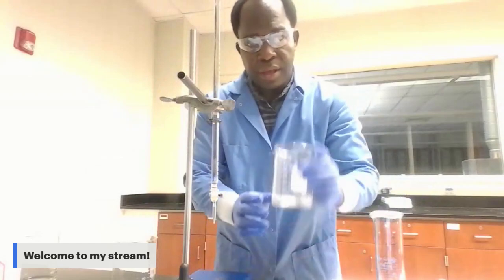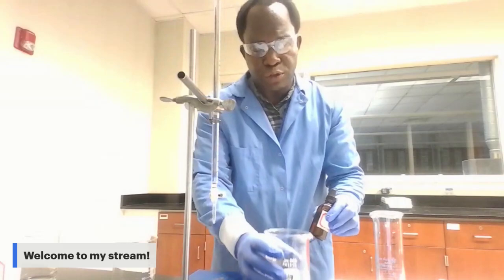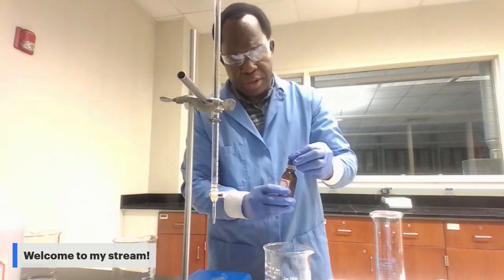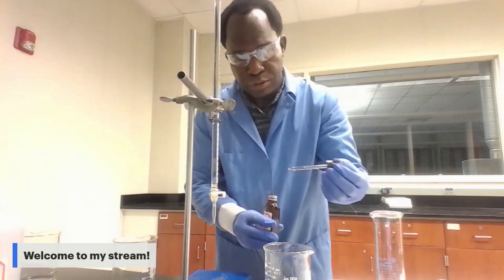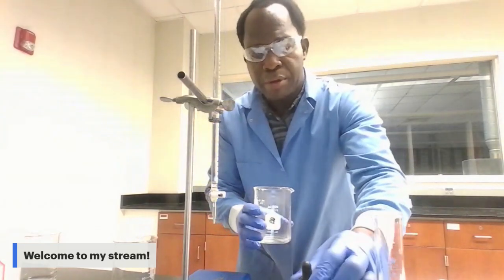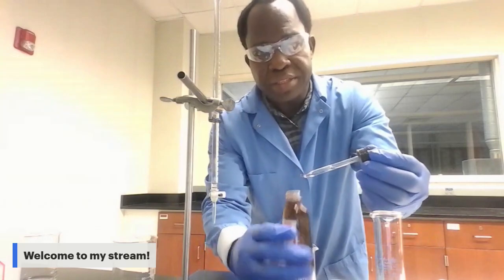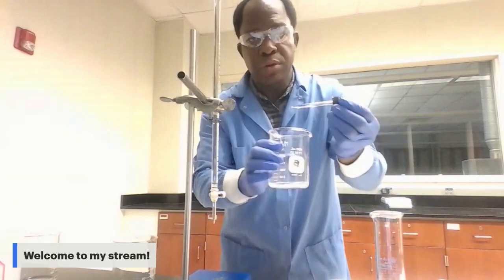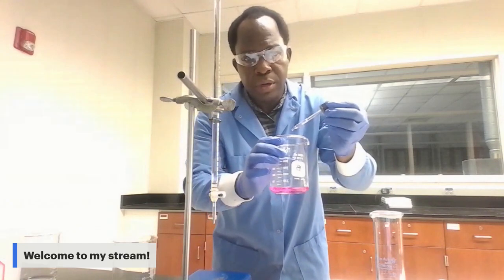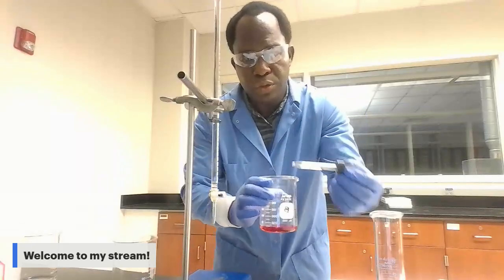Now, after you fill the beaker with 20 milliliters of Ca(OH)2, you have to add the color indicator. You need 5 drops in each solution. Let me lift it up to show you what will happen. I have my color indicator. Look at the solution. It's clear at the beginning, but as soon as I add the drop, the Ca(OH)2 changes to pink.